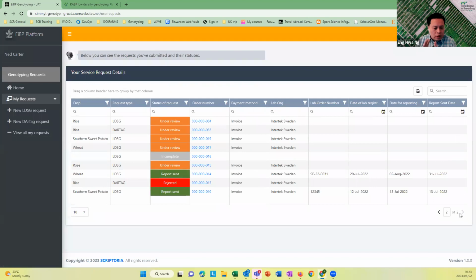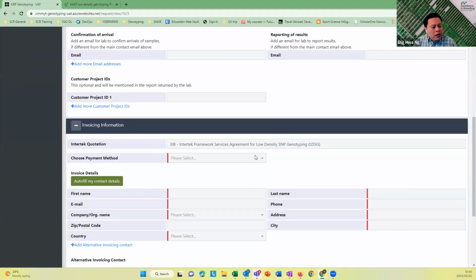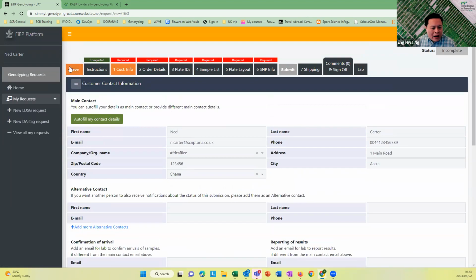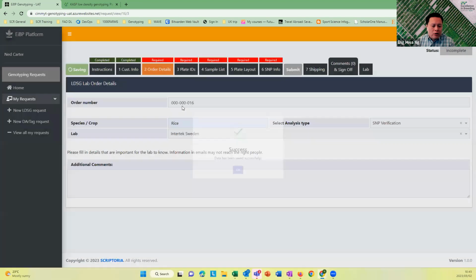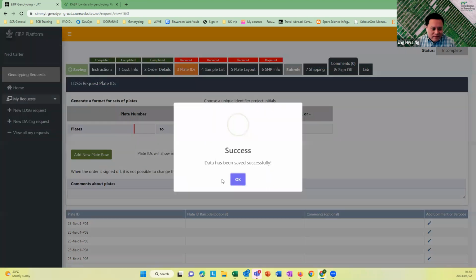So that becomes yours to keep, and we don't need to handle any sensitive information unnecessarily. Again, we want to make sure that we only pass on the required information to trigger a job with a service vendor. There's no point in passing on additional information back and forth, because that adds confusion and transaction costs. So yeah.